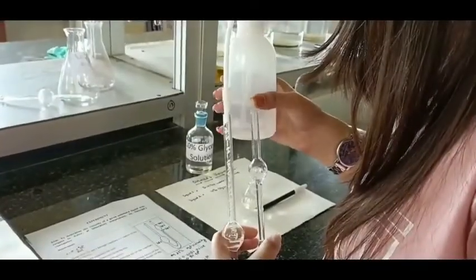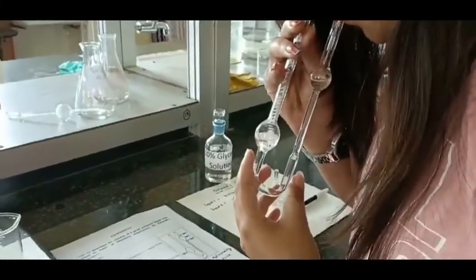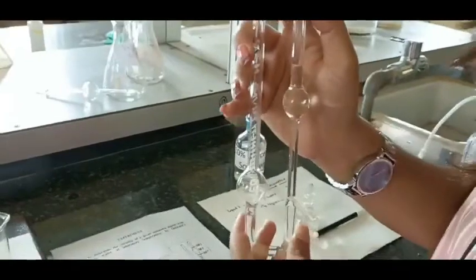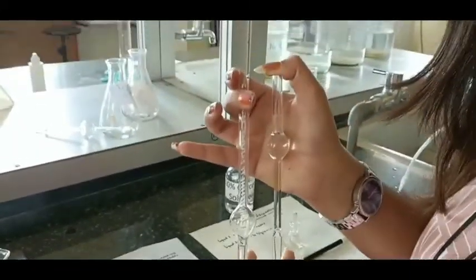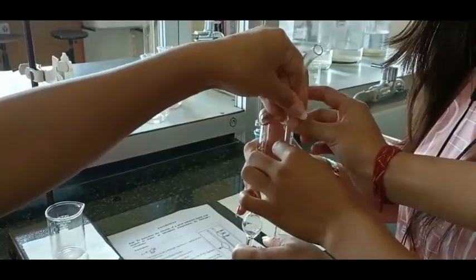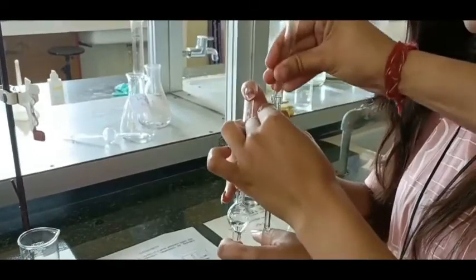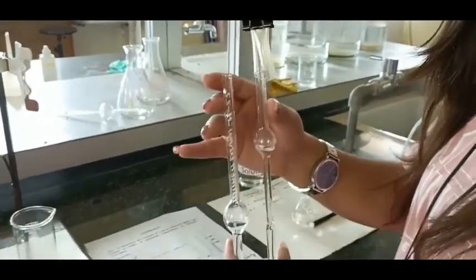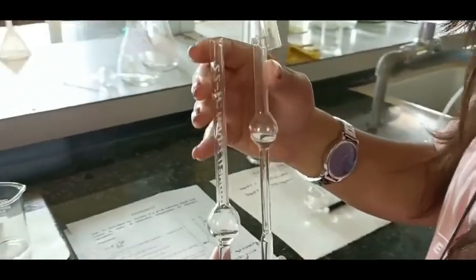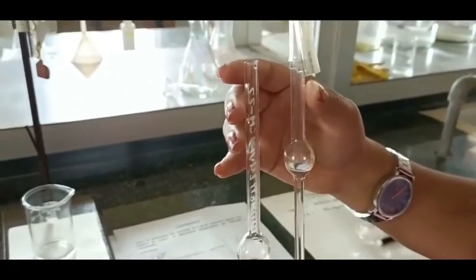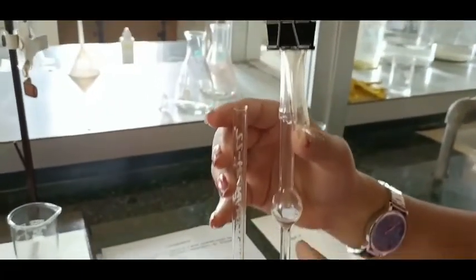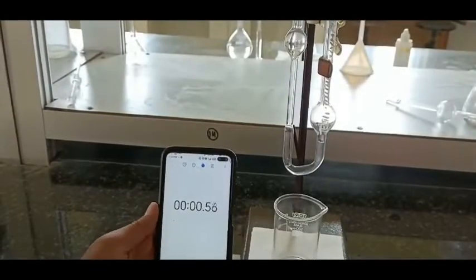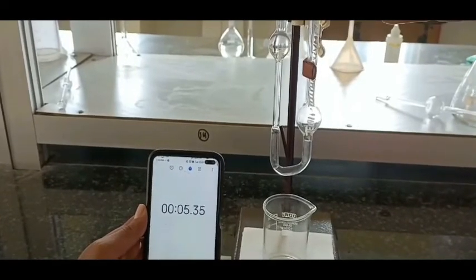Now I will show how to do this experiment with the viscometer. We suck from bulb B up to bulb A. Here you can see the etched mark — up to this mark we have to fill the liquid. We adjust the rubber cork to maintain constant pressure. When we remove our finger, the liquid does not move at all — this is how we maintain pressure. If we lose pressure the liquid starts moving.